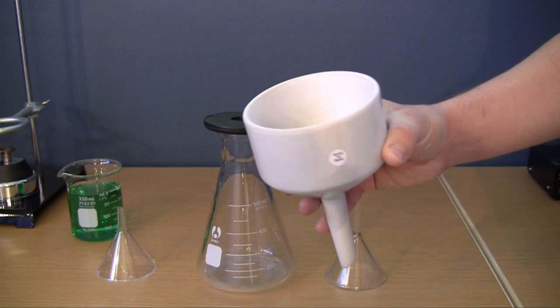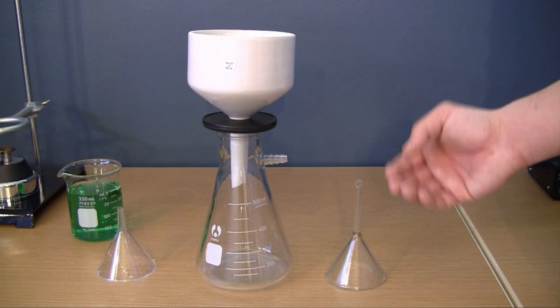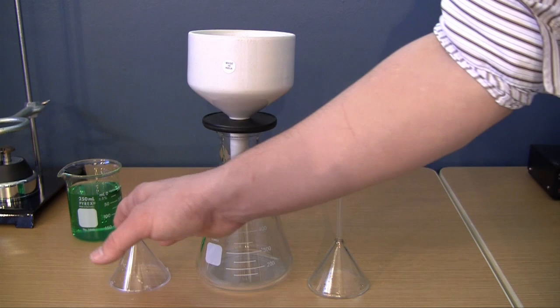But basically I just want to mention that whenever someone talks about a funnel they can be talking about a wide variety of different funnels. But for our labs what you typically need is either a standard glass funnel or a standard plastic funnel. And you can just find these off of Amazon.